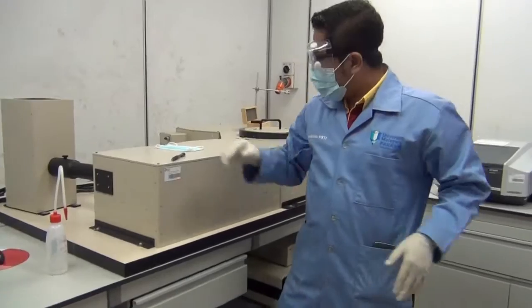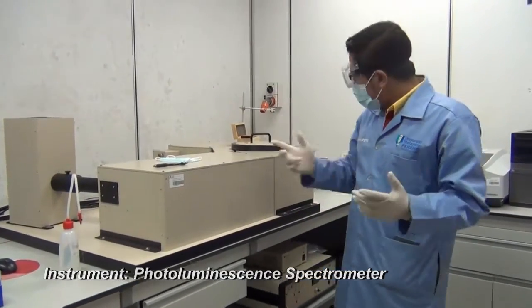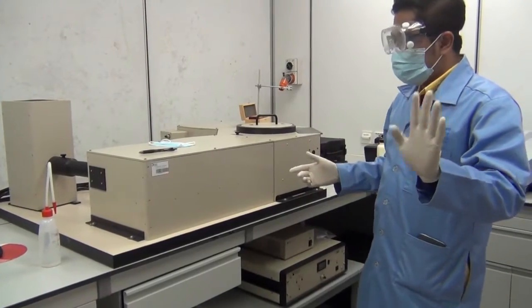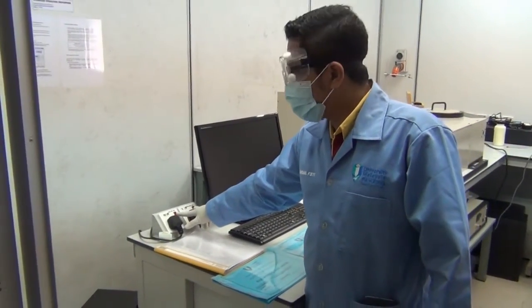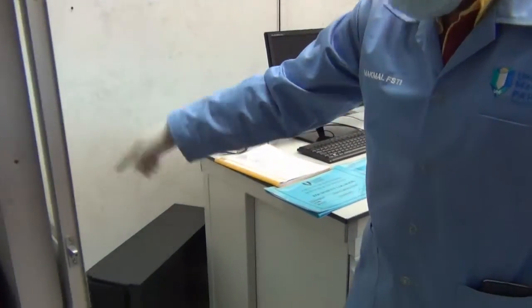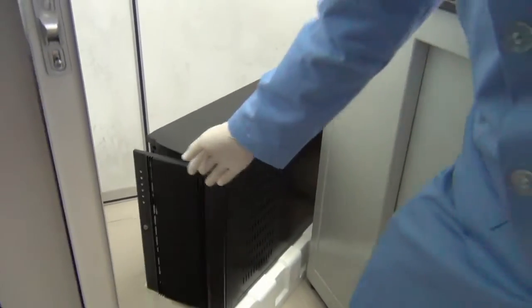Now, what you need to do is, this is the machine. Before you start everything, make sure you warm up the machine properly. And there are, how many? 4 switches to be switched on. The first one is the switch of the computer. Okay, if including these 2 switches, not 4 but 6. 1, 2 switch. Then followed by the switch of the computer. Simply open the cabinet and you see the switch over here. Switch it on. Close it back again.